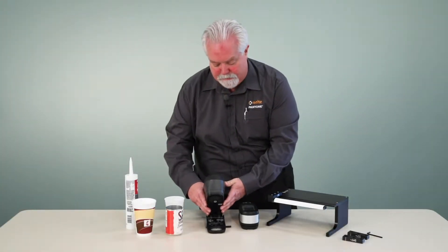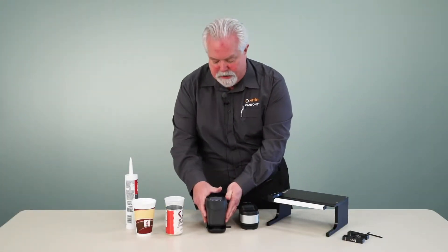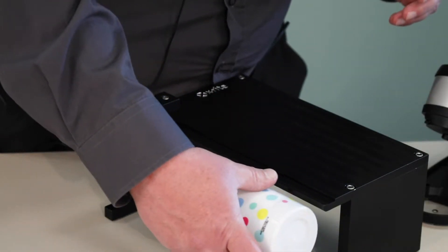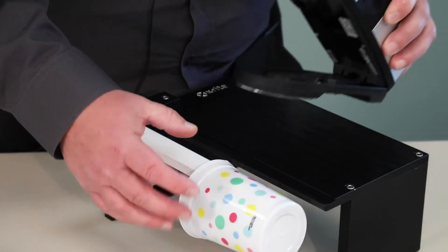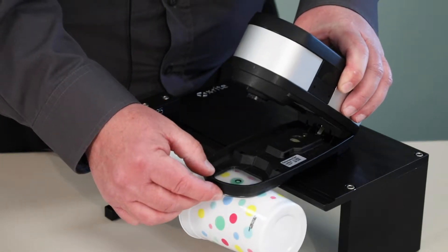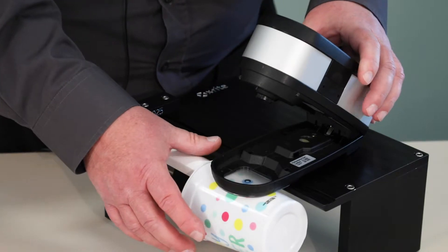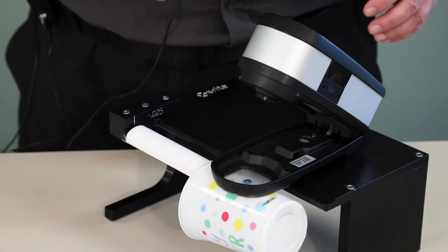Let's take a look at how we actually measure with this device. I'm going to start out today with a plastic cup and our X-Act instrument. I'm just going to place the cup over the arm and place the X-Rite X-Act instrument over the sample.